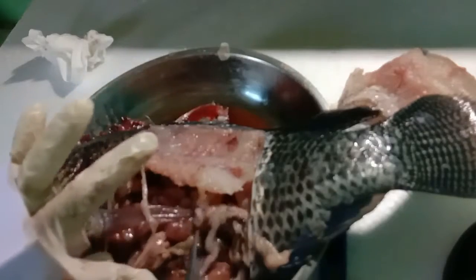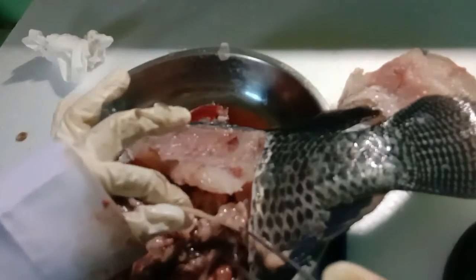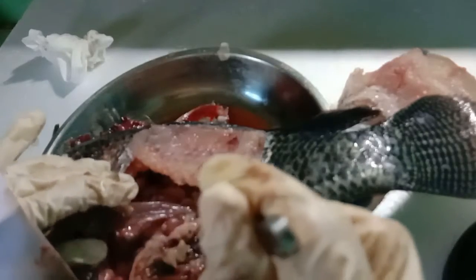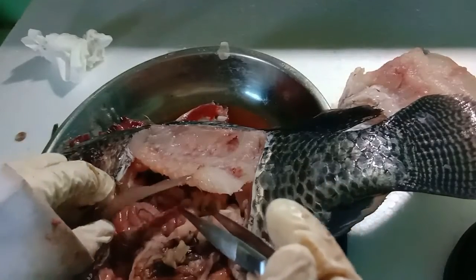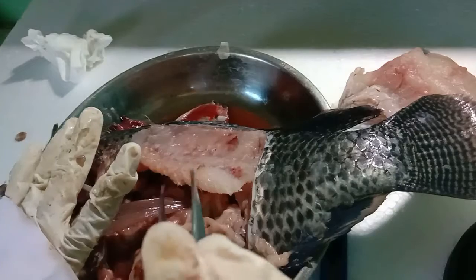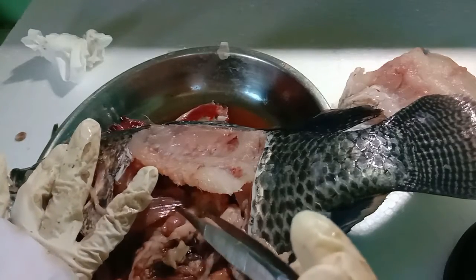Here is white. The main function of the intestine is to digest and absorb foodstuffs. In addition to digesting and absorbing foodstuff, the intestine is critical for water and electrolyte balance, endocrine regulation of digestion and metabolism, and immunity. After being digested and absorbed in the intestine, the remaining food substances that will be excreted will be accommodated in the rectum.